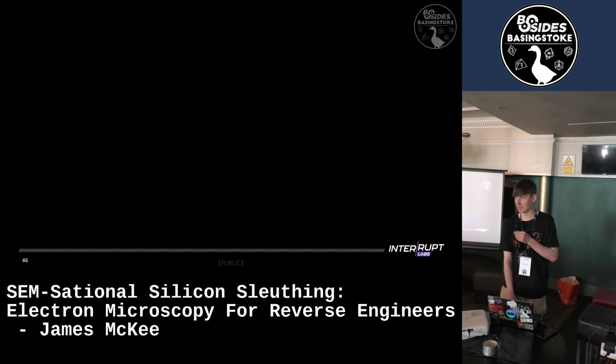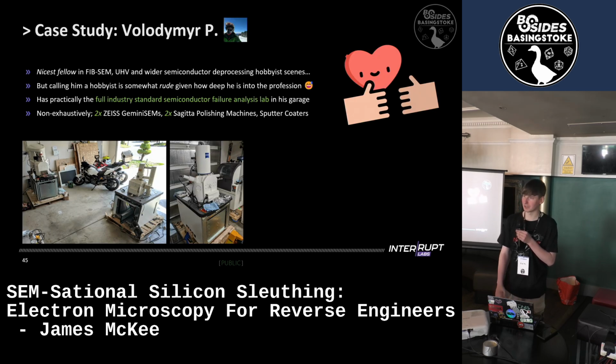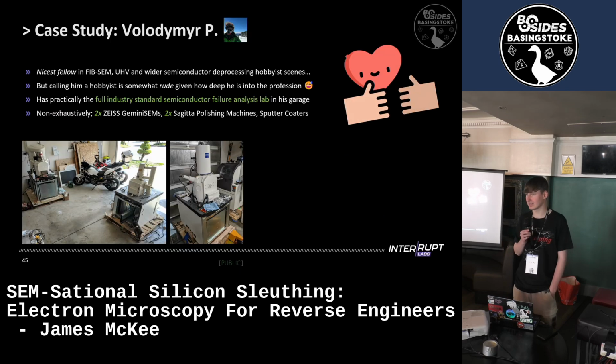You do have specimen beam interaction, but at the lower accelerating voltages and beam currents, you don't cause enough damage to actually blow the bits. With things like the FIB, you'll see quite a lot of damage, which is like doing etching, but with imaging, especially at the lower accelerating voltages, you won't cause any noticeable damage.